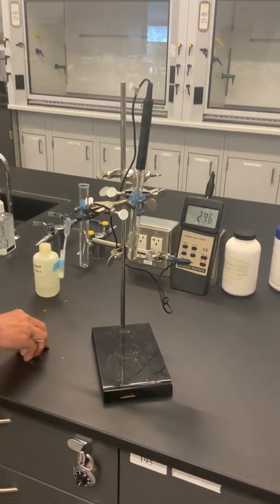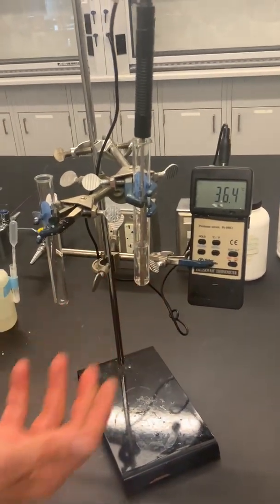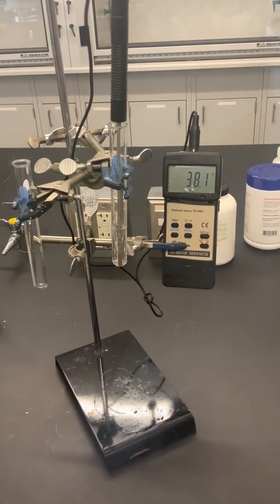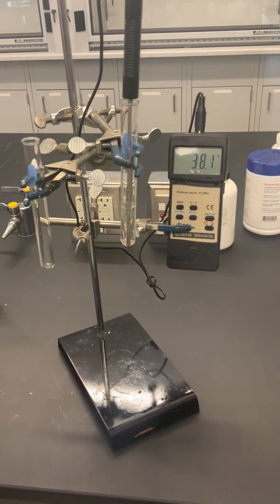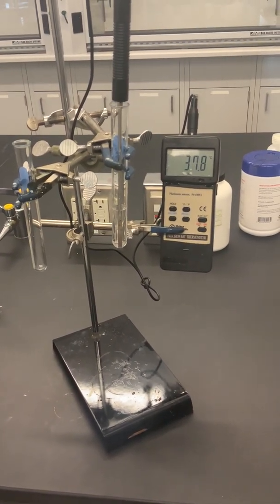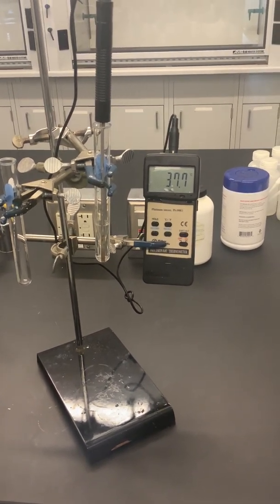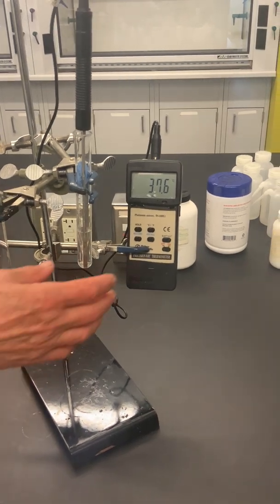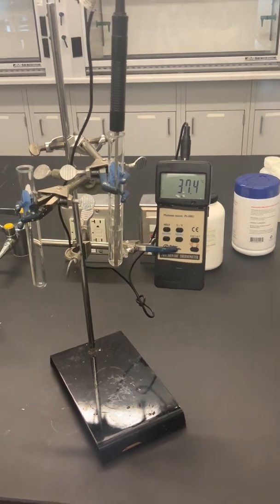If you look carefully at the reaction mixture, you don't see much. No evolution of a gas, no dramatic color change. But if you look at the thermometer, you can easily see that the temperature is going way up, a fairly startling amount, from 23 to about 38 degrees Celsius. And if you touch the bottom of that test tube, it is warm.